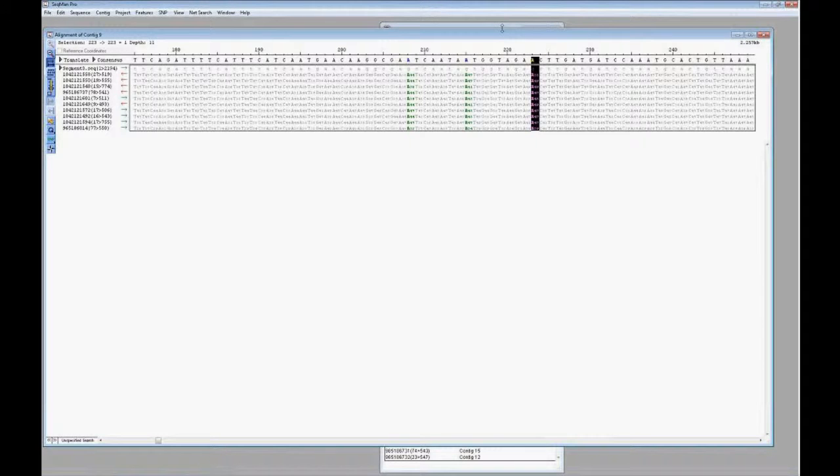Okay, great. And while you're here in the alignment view, we have another question regarding that, which is, why can't I see trace data for these samples? Yeah, good question. You'll notice before we had the little expandy arrows next to each of the reads. Those aren't visible here because what I imported was FASTA data. So in this case, I don't have the supporting trace data.